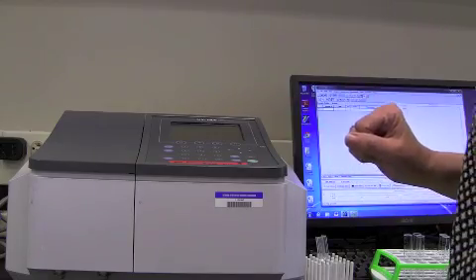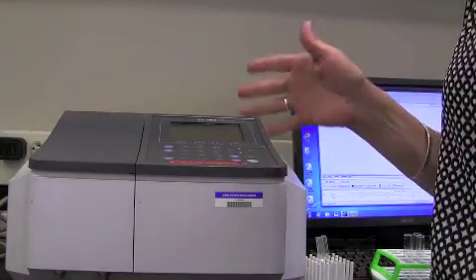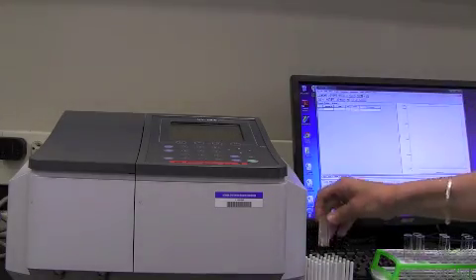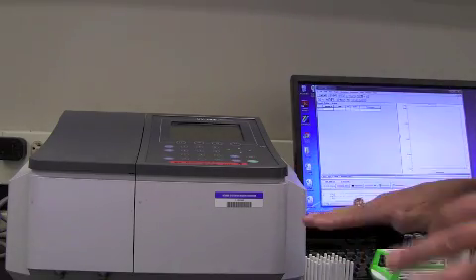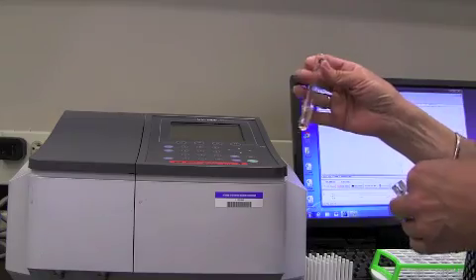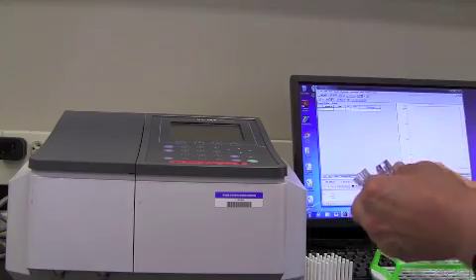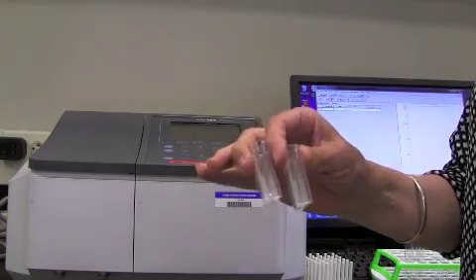But the basic principle here is that the more color you have, the more absorbance you will get, and we're going to measure the absorbance using the spectrophotometer. The first thing we need to do is to zero the instrument. We need to tell it what no absorbance looks like. And to do that, we use the sample we set up where it's just the cholesterol assay mix and isopropanol, that is our 0. And we're going to pour this into 2 of these little plastic cuvettes here.